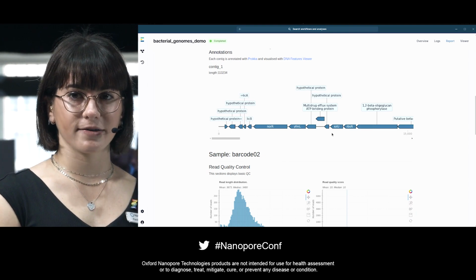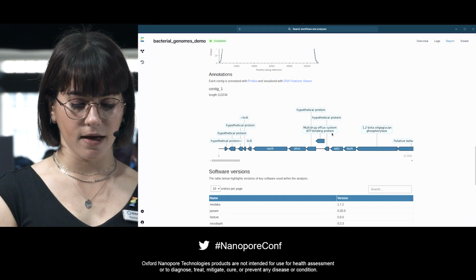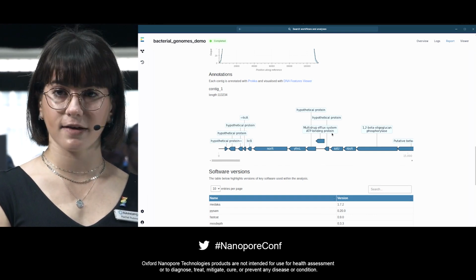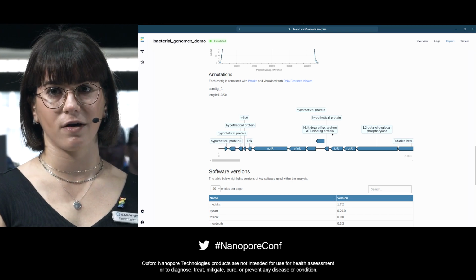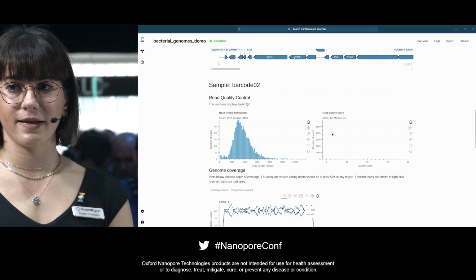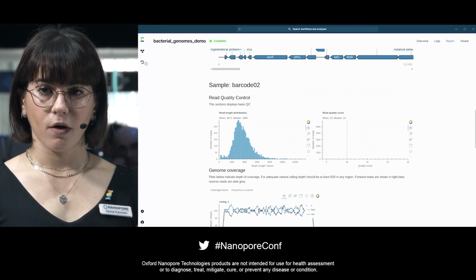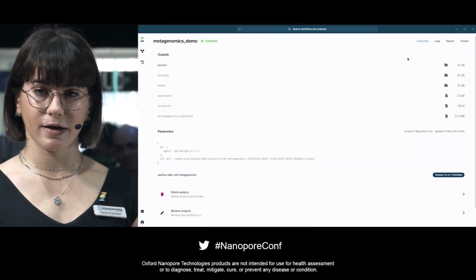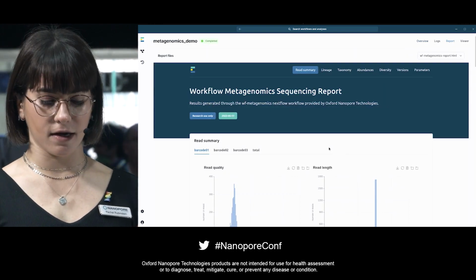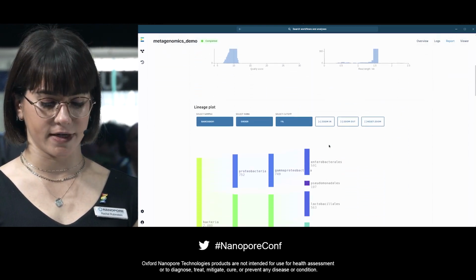This workflow is a great companion to the isolate sequencing protocol that I just mentioned, and it is also able to resolve complete genomes and exogenous plasmids while creating high-quality reference assemblies and de novo assemblies. This also works with multiplexing. The metagenomics workflow works with inputs from amplicon-targeted or shotgun metagenomic sequencing, and this helps us detect unknown and novel pathogens that often can escape traditional methods of detection.